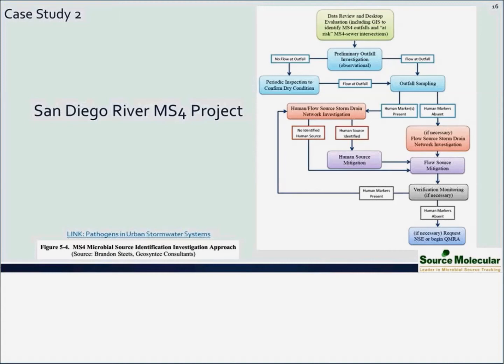The decay rates are going to vary. So if you can capture it the moment it drops in there, it'll work, but that's not really realistic. And so we've shied away from it. I think it's going to be possible at some point in the future, but we've shied away from it. That's my opinion.